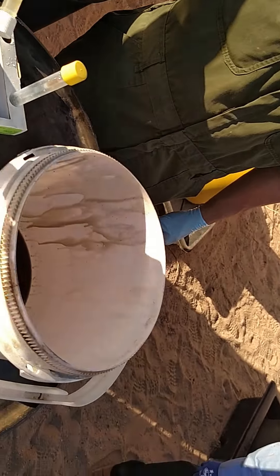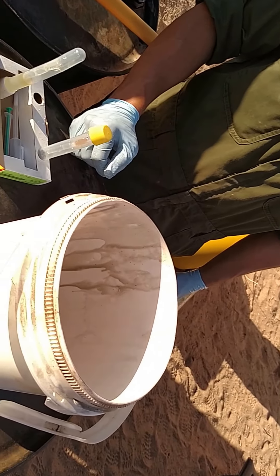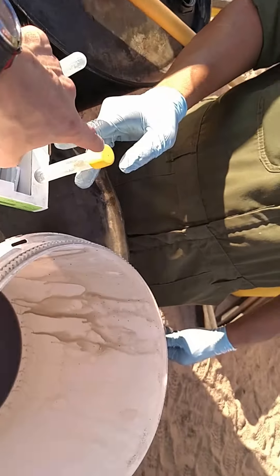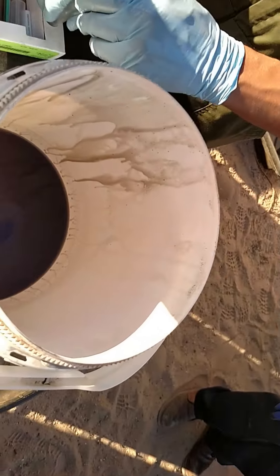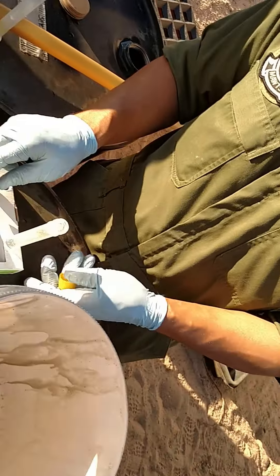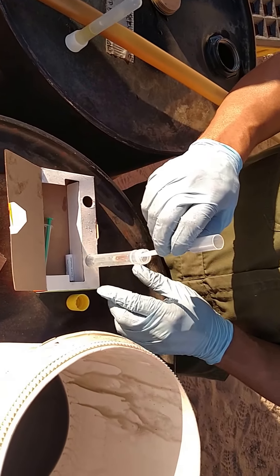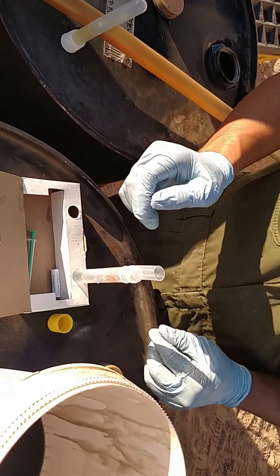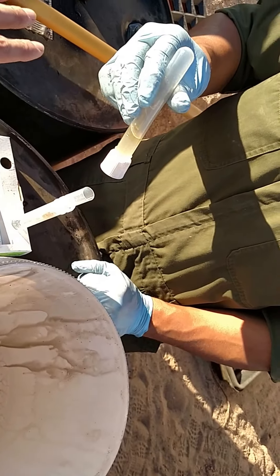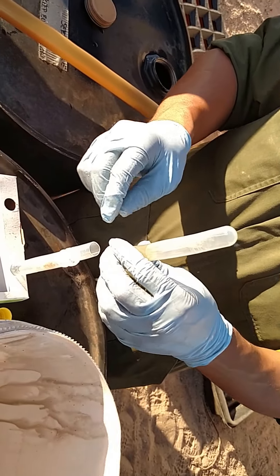All right, that should be good enough. Take the yellow cap off tube two — set this aside, we're gonna have to wait another minute. Now put the filter inside there — yeah, like that, inside the flat part, there you go. Now take this and don't shake it at all, but slowly open up the vent. It should not come out unless you're squeezing it.